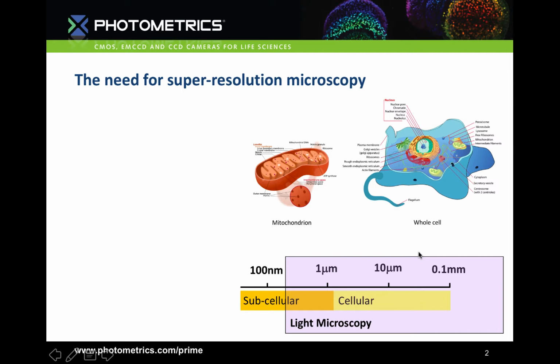Wide field and confocal are great. They allow us to look at things like whole cells and some of the organization within them. They're great techniques because light is non-invasive. It doesn't bother live cells too much, which lets us see real-time dynamics of living organisms. It's also nice because there are so many fluorescent probes that we can easily use multiple fluorescent dyes to see the organization of living cells and even how structures within cells interact.